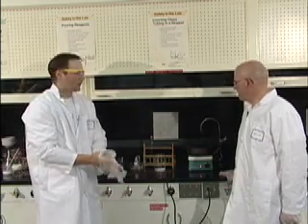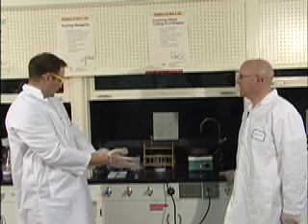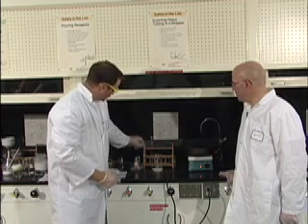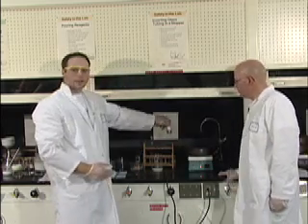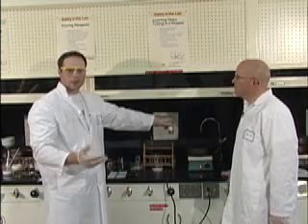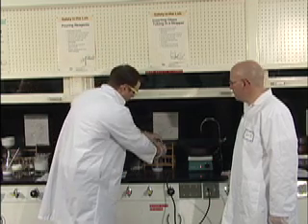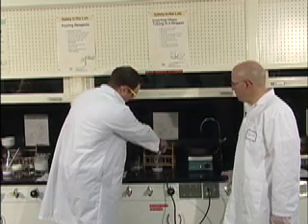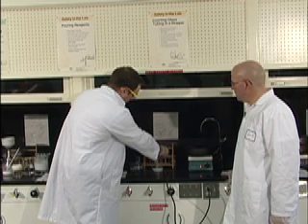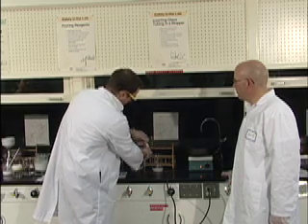So now we have to throw three things in there, right? We have our salicylic acid, acetic anhydride, and we're going to add to this mix 5 to 10 drops of sulfuric acid. I would personally use closer to 10 drops. It's just a catalyst to get the reaction going, so the more the better. And 12 molar sulfuric acid is exactly like it sounds, very concentrated.